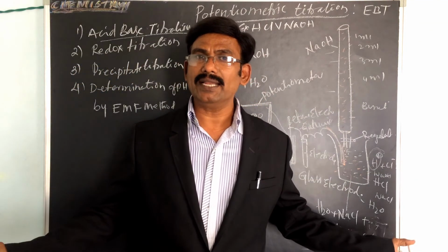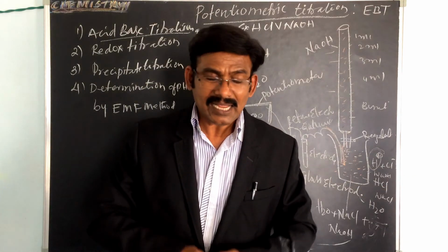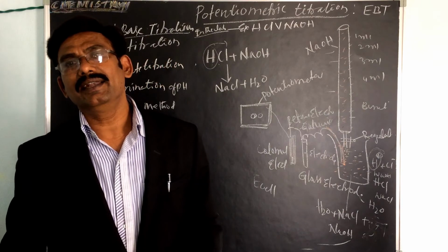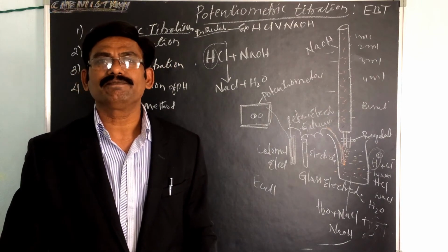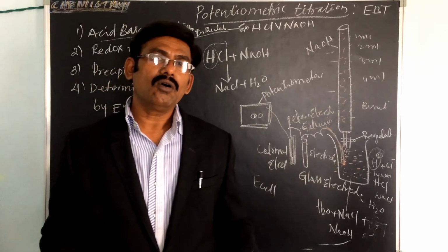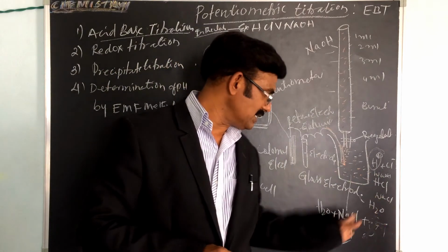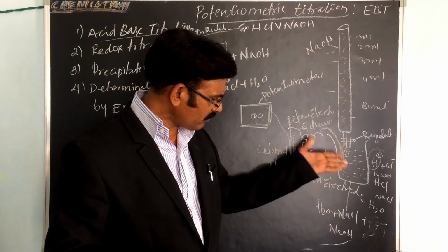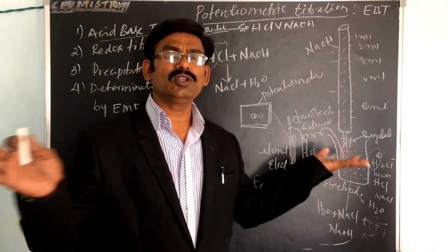At the end point, the EMF suddenly decreases. After the end point, there is no noticeable change in the potential, because NaOH is being added directly. After the equivalence point, after the end point, there is no change.